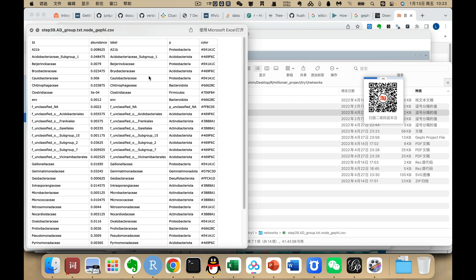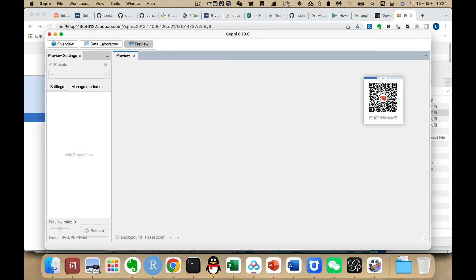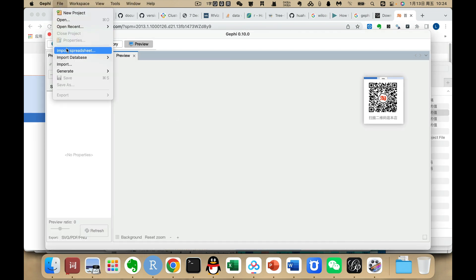We also have a node file. The first column is the node ID, and we have an average abundance for the size setting — if you need this, you can use this column for size. This is the node label, and here is its corresponding file level. I also added a column of color for each node. Then we can open the Gephi software and use Import Spreadsheet.